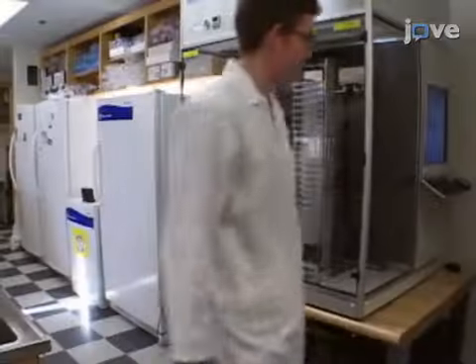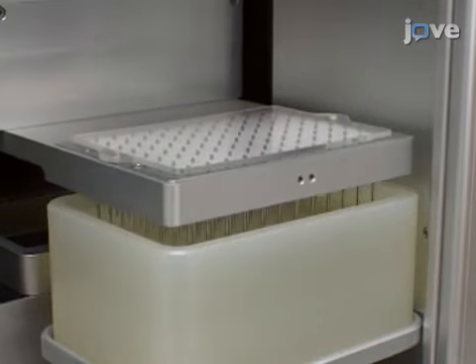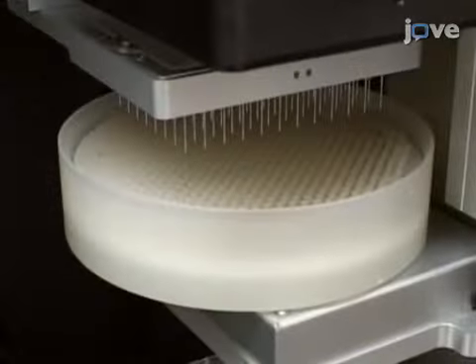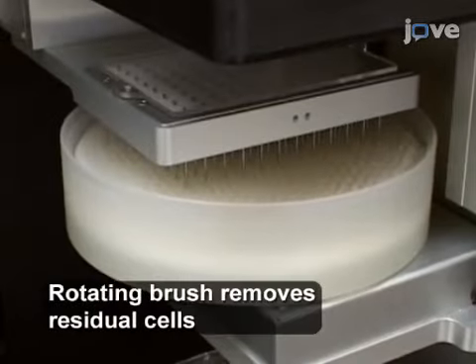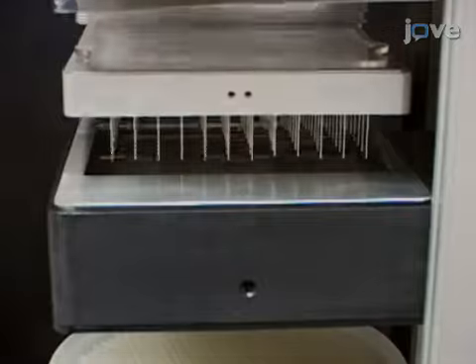On the morning of the procedure, sterilize the robotic platform by first soaking the pin tools five times for ten seconds in the water bath station to remove any residual cell clumps. Then soak the pin tool twice back and forth in the brush station and twice in the sonicator station for 20 seconds each soak to remove any remaining debris.